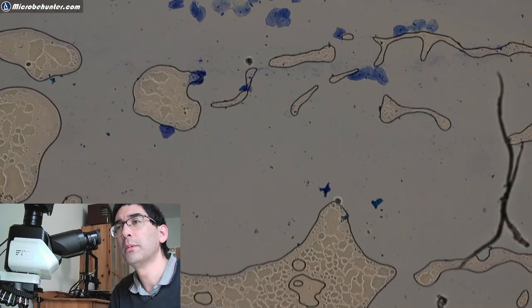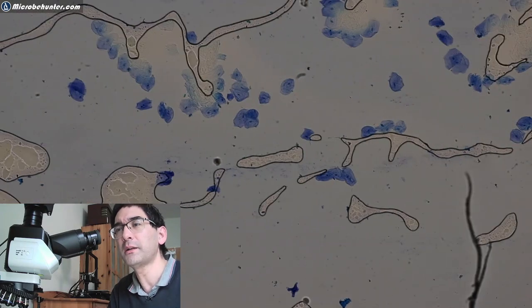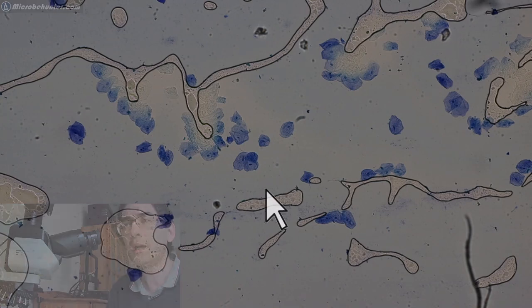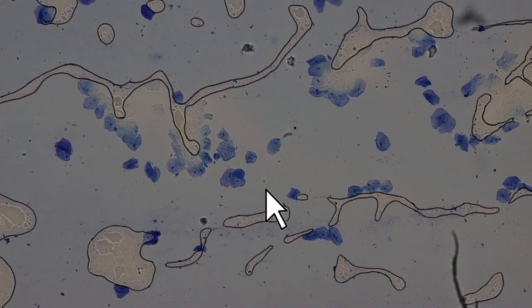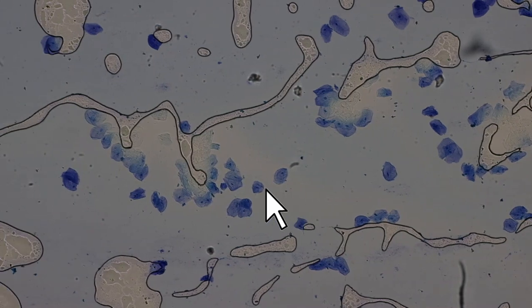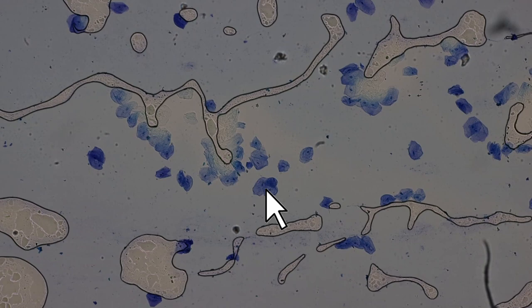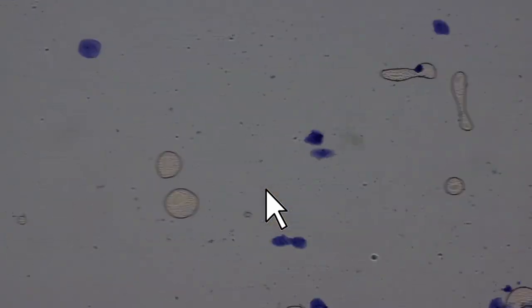See, there are some air bubbles here. Or it could be, I think that might be the explanation. I think that's the explanation, see? There are air bubbles here. Over here there are air bubbles. And here, the background, this is already where the methylene blue is, okay? But it is so bright that you almost don't see it. And the cells, the cheek cells, they are now stained blue, okay?